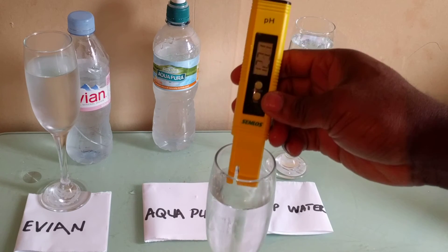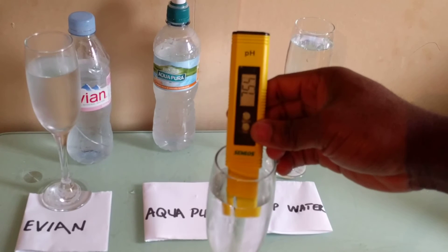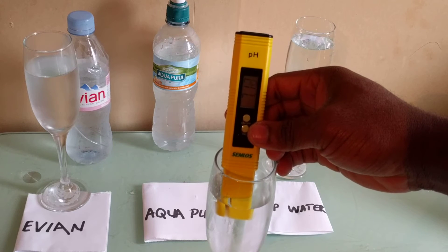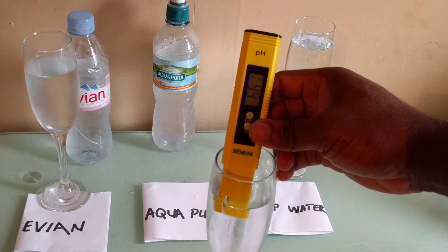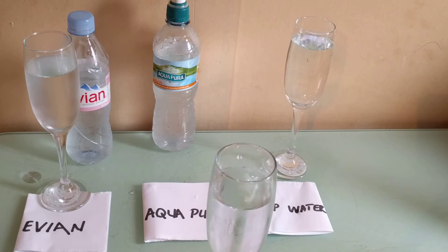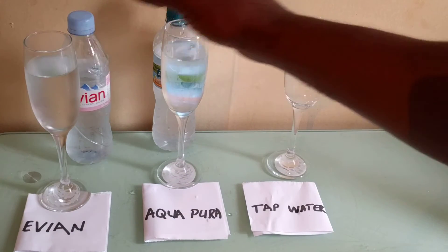Now let's test the Aqua. The Aqua is coming in at 6.6 — let's call it 6.5. So the Aqua is 6.5.